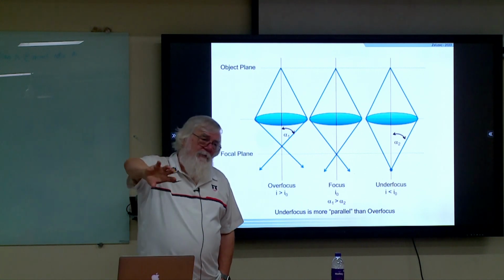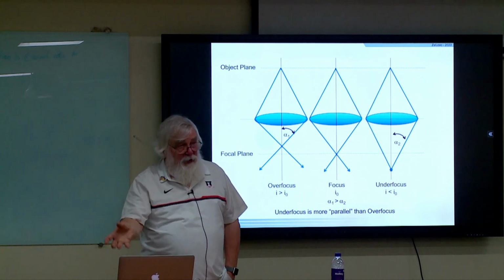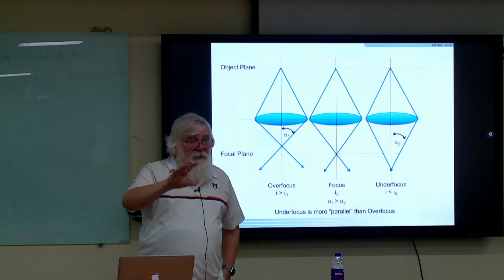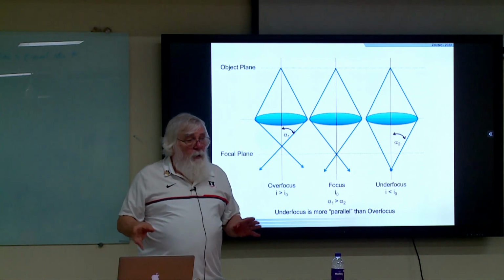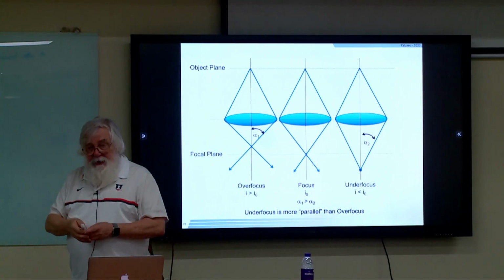When you turn it counterclockwise, you're decreasing the current. That's usually the convention, particularly on the older microscopes. The newer microscopes, because there are so many lenses, it's hard to keep track. But generally, when you say I want to go to under-focus, you go counterclockwise. That's weakening a lens. And when you go clockwise, you're strengthening a lens. Just keep that in the back of your mind.